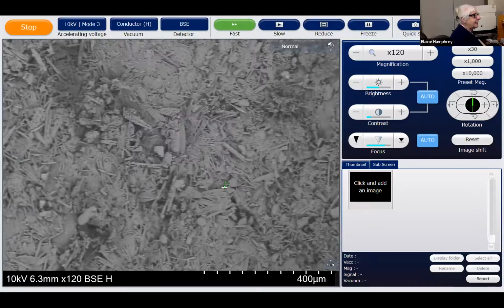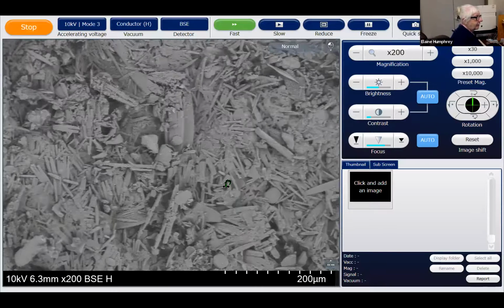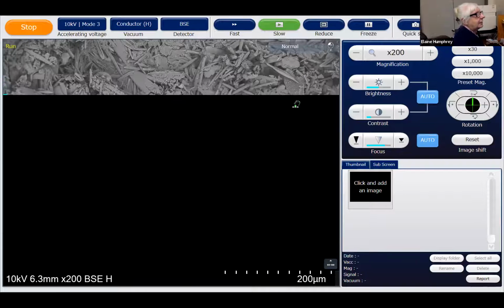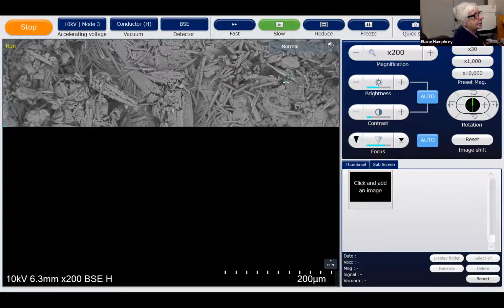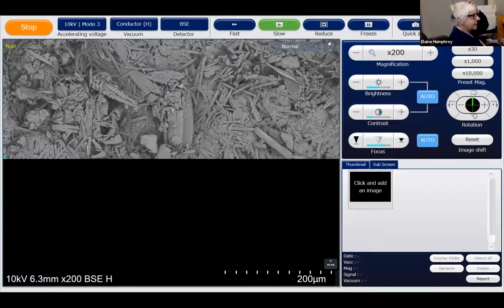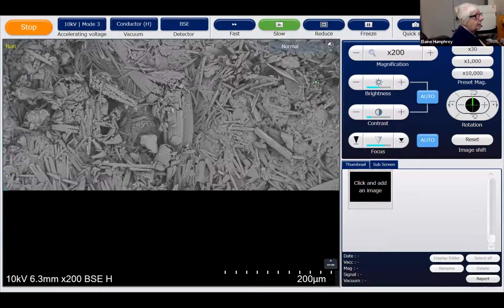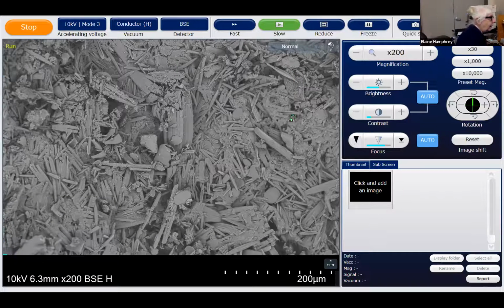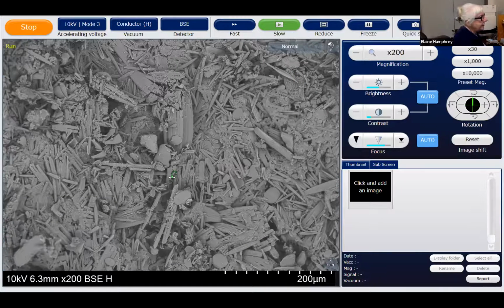Well, by now you'll be seeing all the same things. So now wait a minute, let's do a slow scan. Oh, there's a piece of a Coscinodiscus without its organic coating up in this corner. And there's one of the canoes. And there's some of these fan-shaped ones.